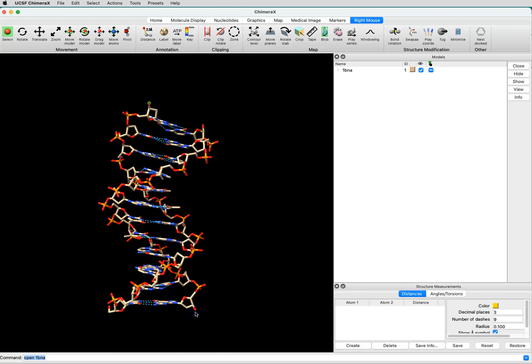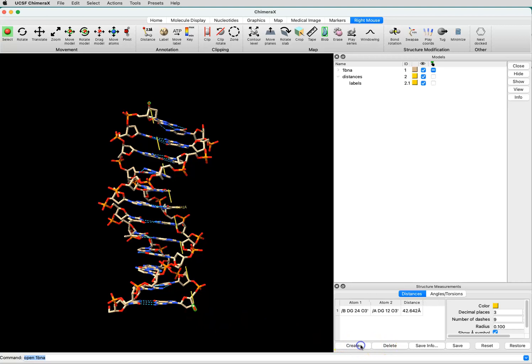Then I would hold the Shift key down and right-click on an atom at the bottom. I'm going to click and drag over it to select it, and then I will say Create to measure that distance.